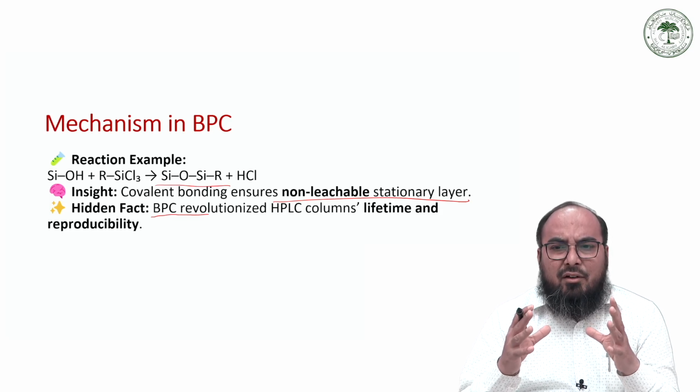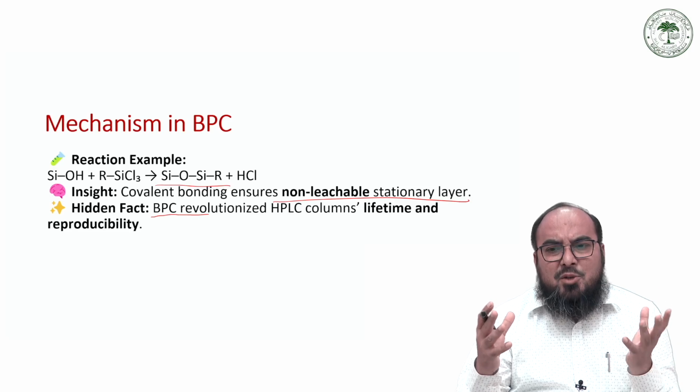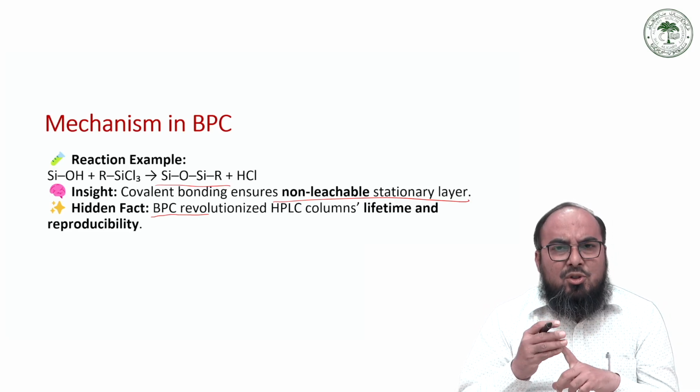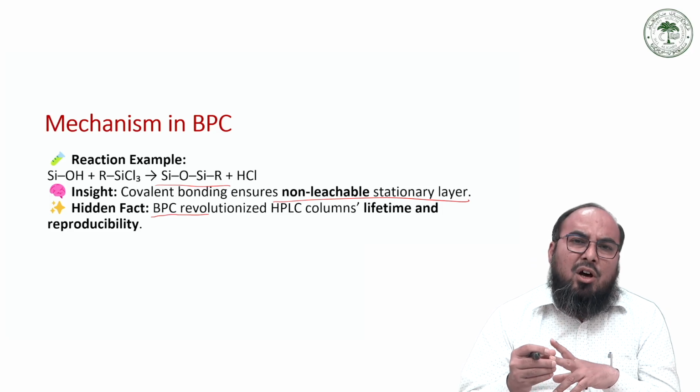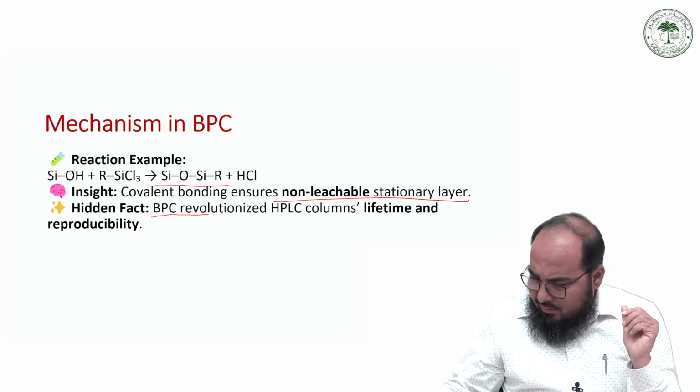and by using such stationary phases that are stable enough, it increases the working life of any HPLC system, and it gives you very reproducible results in terms of the number of peaks and the area under each peak. That is, you get reproducible results.